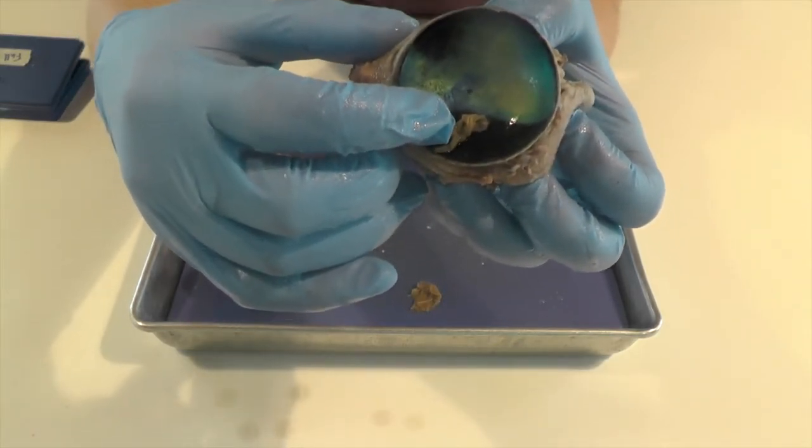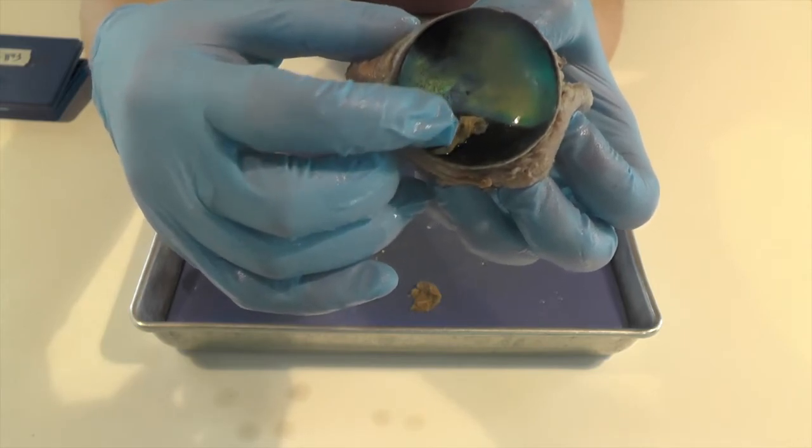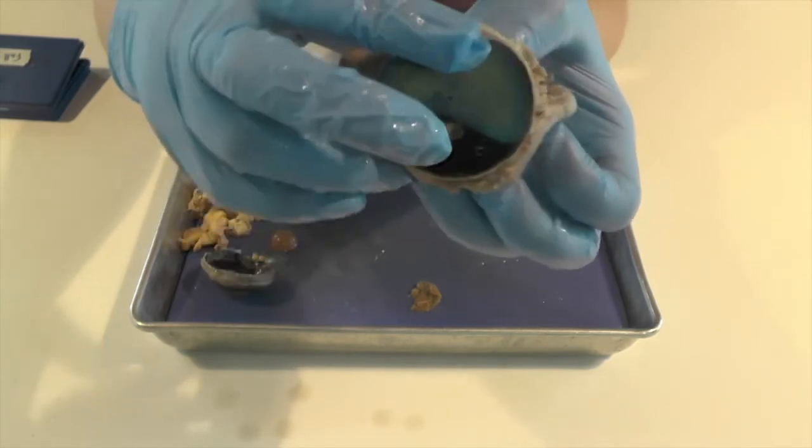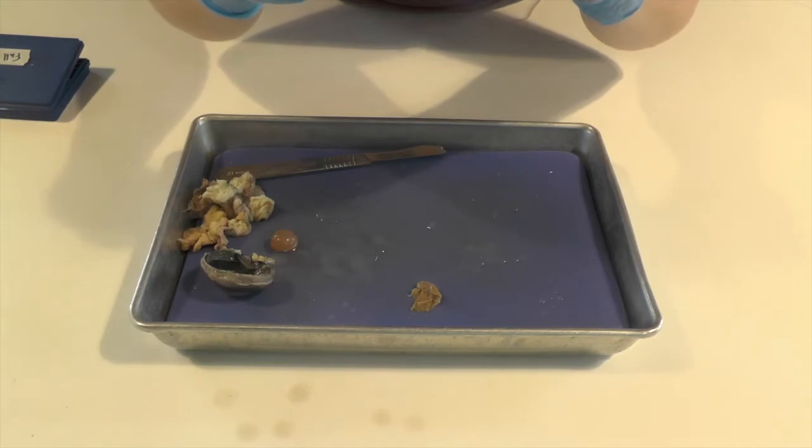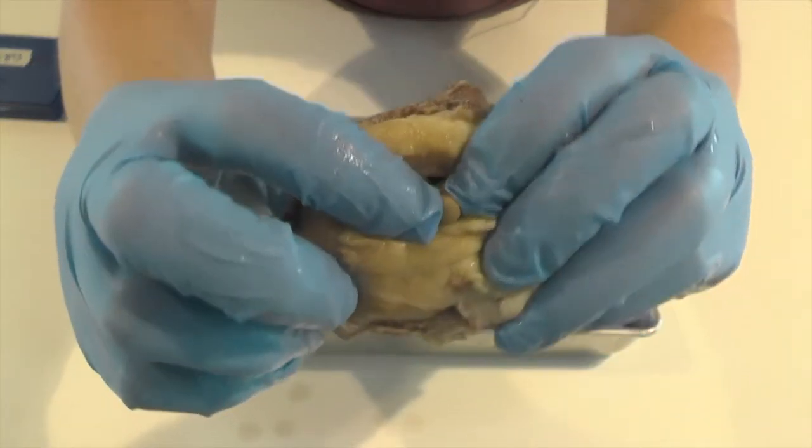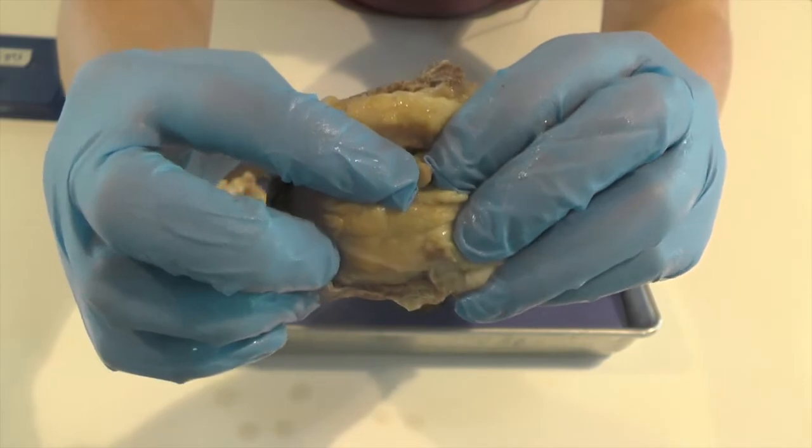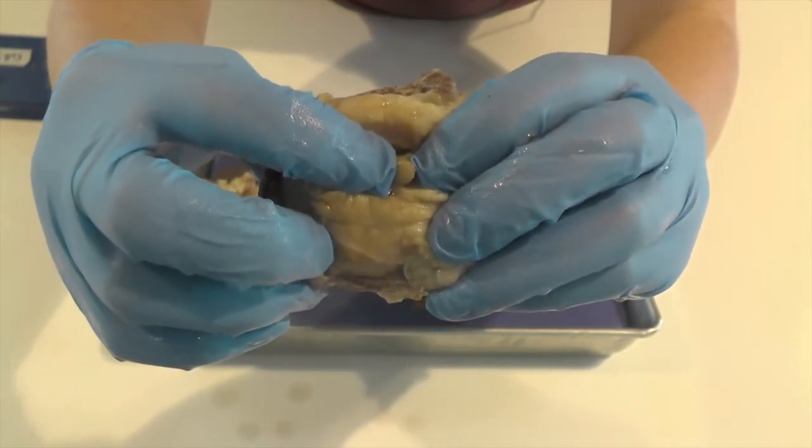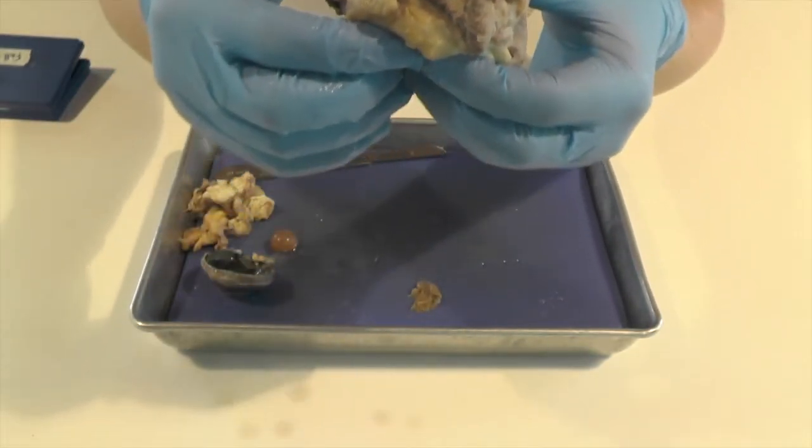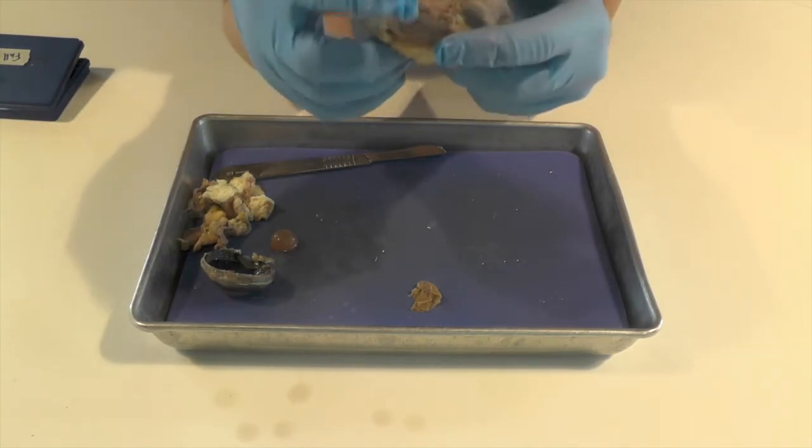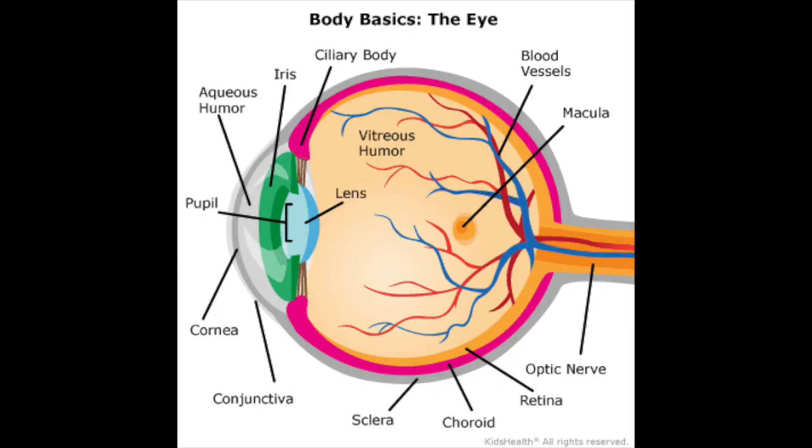So everything that you can see is sent through here, through this nerve. We can see the back of it here. Here's the back of it. But this normally, this was cut. So normally this would go all the way back into your brain, into your occipital lobe. And that's where all that information gets turned into pictures in our head.